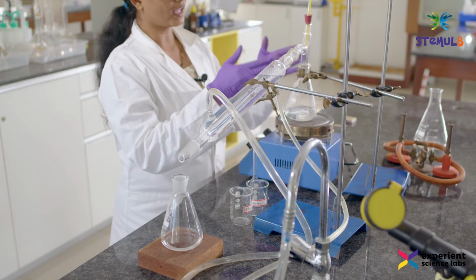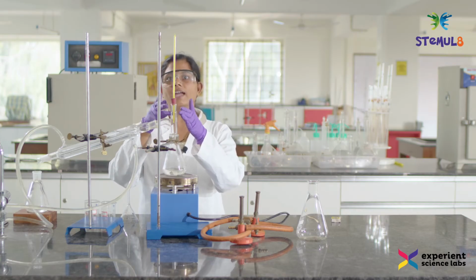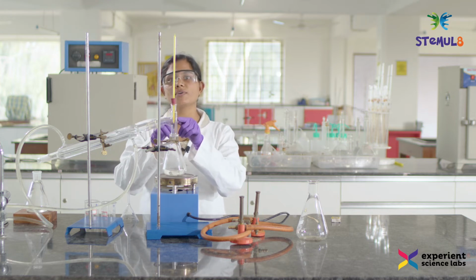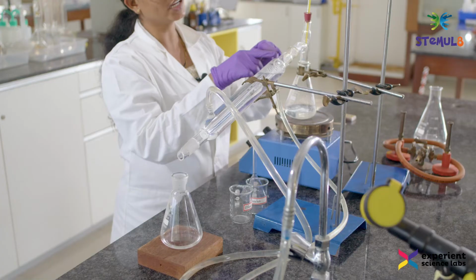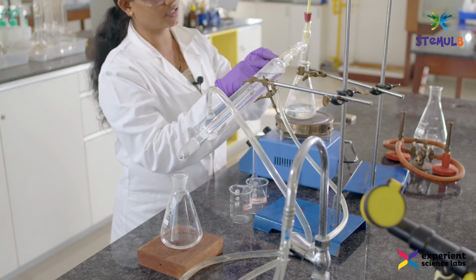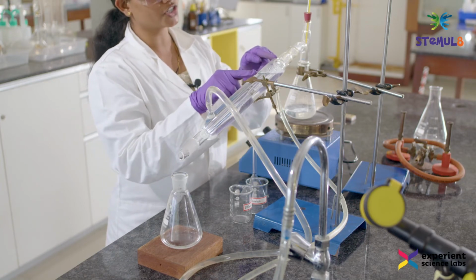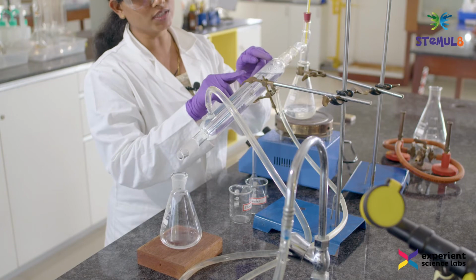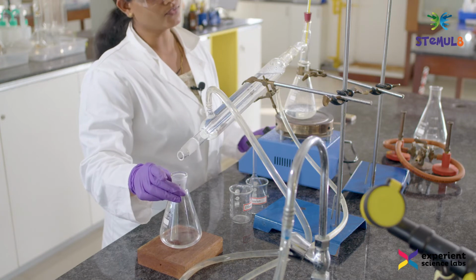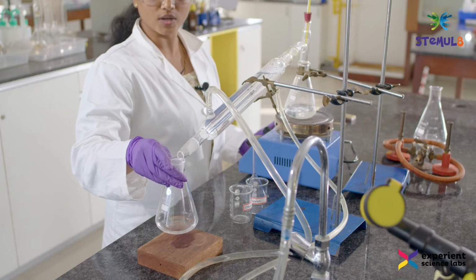They are boiling, and since ethanol has a lower boiling point, it vaporizes to the distillation head, and now the temperature in the thermometer is around 80 degrees Celsius. So these vapors of ethanol will move towards the inner tube of the condenser. And you can also notice here that a few ethanol drops have been collected here, but the rest of the vapors pass through the condenser, and with the help of water circulation, these hot vapors get cooled, condense, and are collected in the conical flask. So now we have separated ethanol from water, and you all can see this in the conical flask.